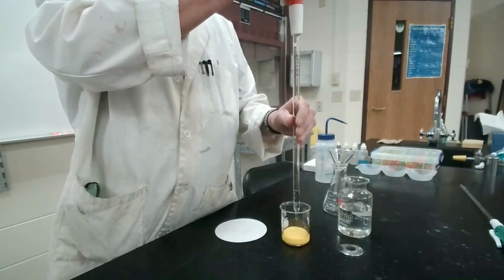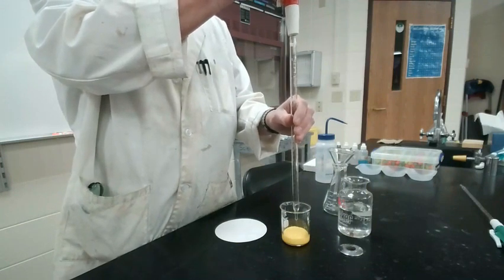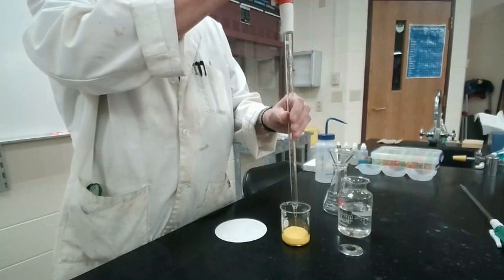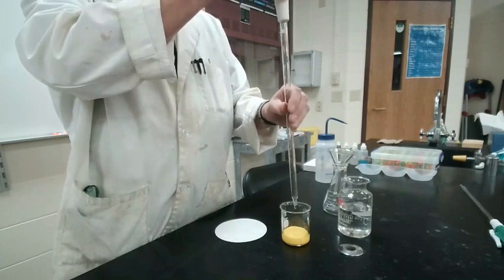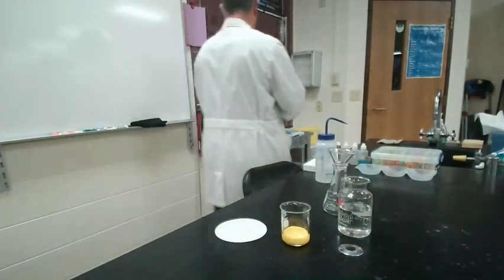So these two clear solutions, ladies and gentlemen, have definitely caused a color change to occur. Definitely a chemical reaction, and we empty this all the way out. Let me get these out of the way, ladies and gentlemen.